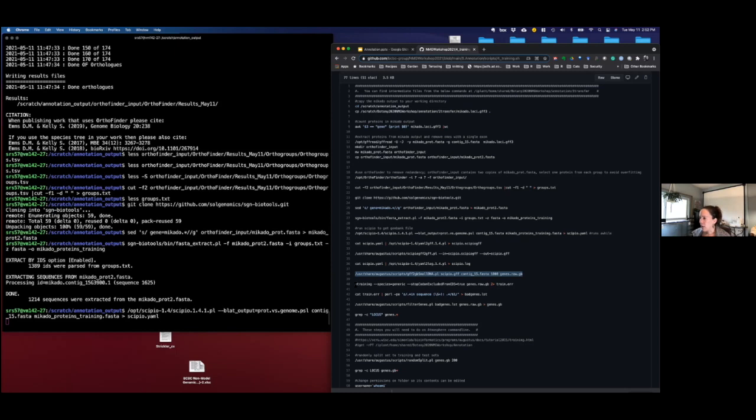Okay, so then you do some training. This training gives you an idea of which gene models look good and which look bad. Anything that has an internal stop codon, or maybe doesn't have a start and a stop, goes into this file called bad genes. So you're basically figuring out which proteins don't really seem to align to the genome properly, and you're getting rid of those from your training set. Once you do all of this, this is your final set here.